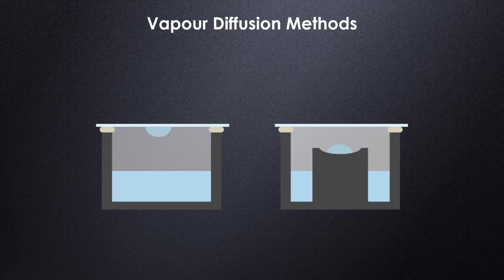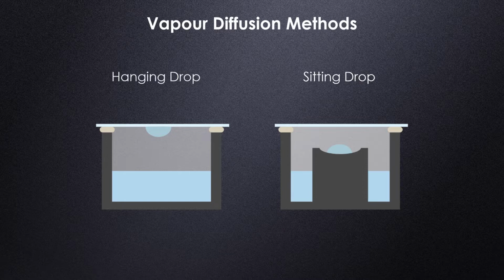Protein crystallization is the process of formation of protein crystal from a pure protein. Many new tools and methods for this have been developed during the last 20 years. Among others, the method of vapor diffusion, either with hanging or sitting drops, remains the most popular method when crystallization setups are considered.